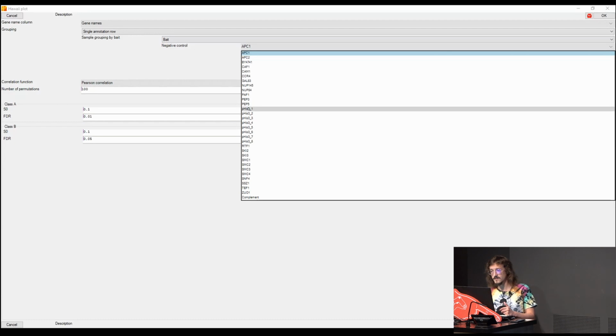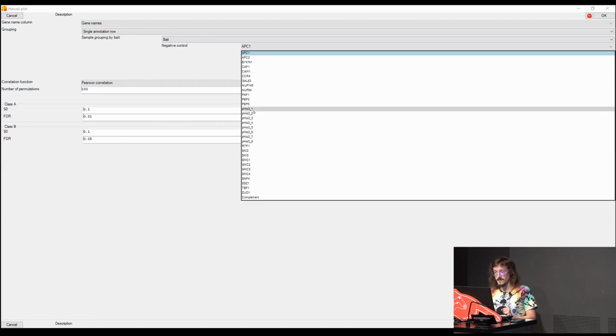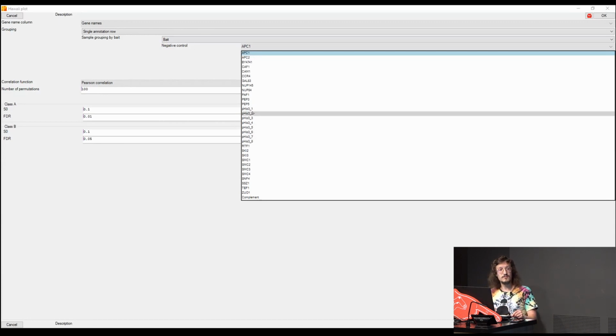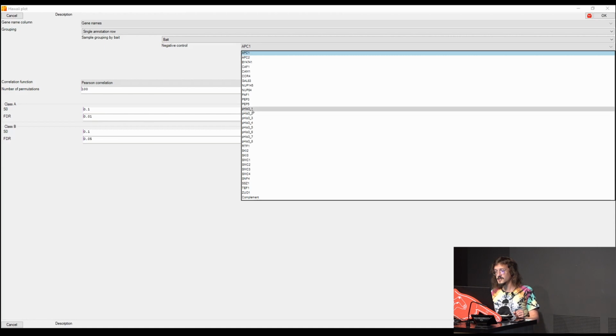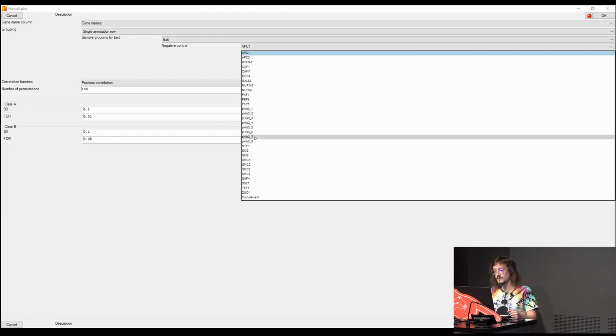Something you can do is, for example, group together these controls or the histone protein that were marked, and see what happens if you just plot, I don't know, APC against one histone, against one replicate of histone, or then add several replicates, maybe all of them, all of the biological replicates that have been done here with the histone, all of the 8 ones that were done.